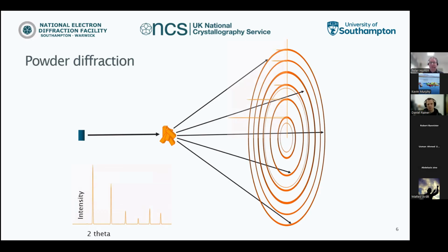And powder is a bulk technique, so compared to single crystal, you can put large amounts of sample down, and you can get significant information. We can get the unit cell, sometimes you can even get the structure. And it is very useful, as these patterns are pretty much fingerprints. So if you do pattern matching, you can normally tell whether the structures are the same or at least different from something already known.